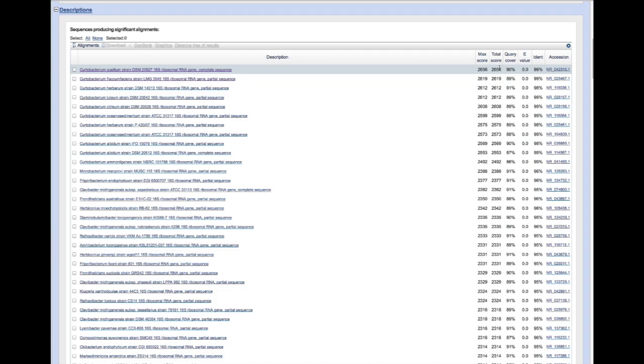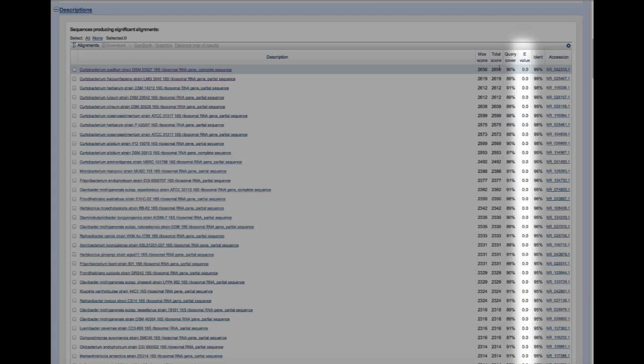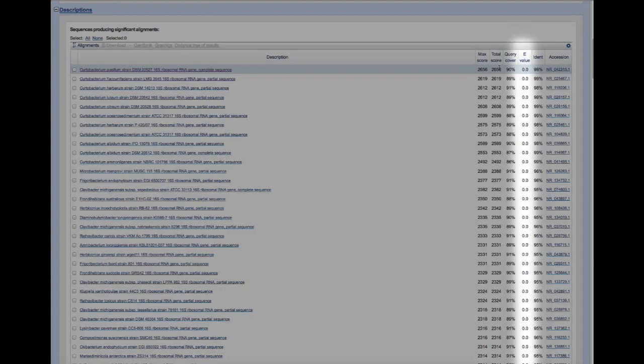The results or hits are listed on the left in order of decreasing score, and the data are on the right, giving us a sense of how good each match is. Which information should I pay the most attention to? The e-value, or expect value. This tells us the probability that we obtain this match by chance alone. If the e-value is 0.001, there's a one in a thousand chance that the match is due to chance rather than homology. If there are 200 million sequences in the database using an e-value of 0.001, that would mean 200,000 hits due to chance. We usually look for e-values that are multi-digit negative exponentials — those indicate significant results, like 1 times 10 to the power of negative 100, or even smaller. Here, the e-values at the top of the list are 0, so we know that our matches are due to homology.